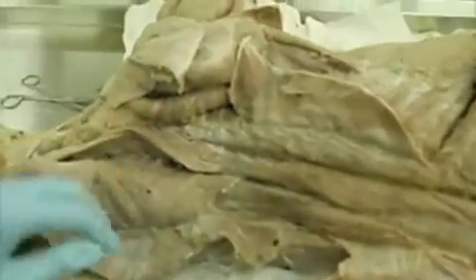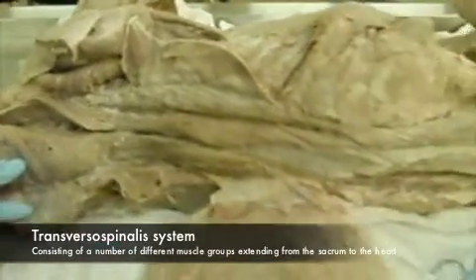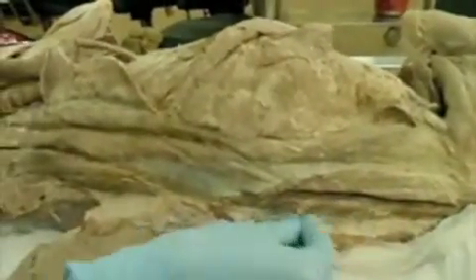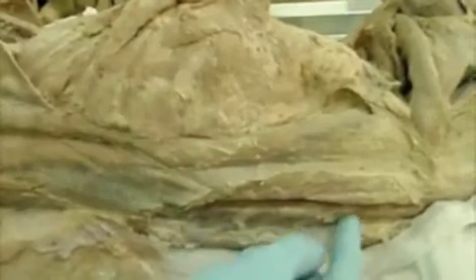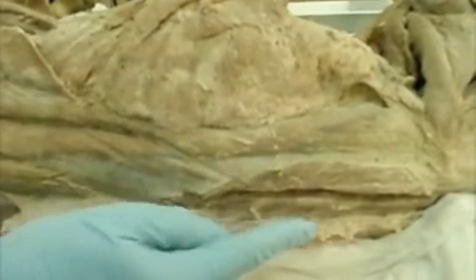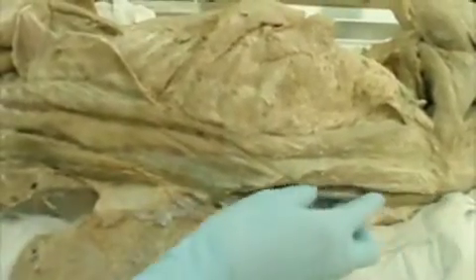Okay, now on to the transverso spinalis system. So this is the most medial system. Here I can feel along the spinous processes of the vertebrae. So the transverso spinalis is right next to them. It borders that. Okay, you can see it here. Right next to it is the longissimus system. So the transverso spinalis has a lumborum part, and then it gets here and it's a little different.